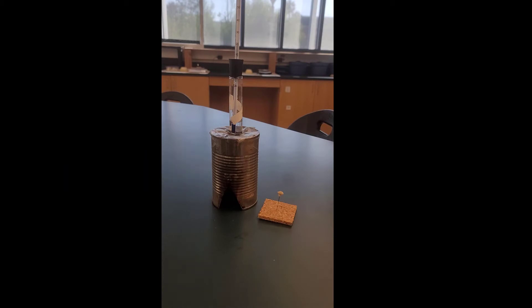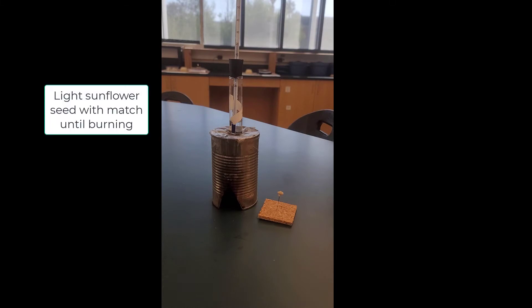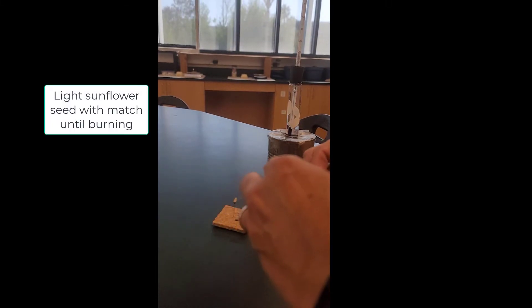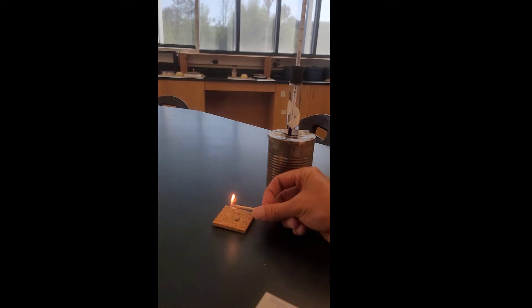What we're going to do first is start with the sunflower seeds. I'm going to take a match, light it, and light the sunflower seeds on fire so they're burning. Then I put the can over the top.